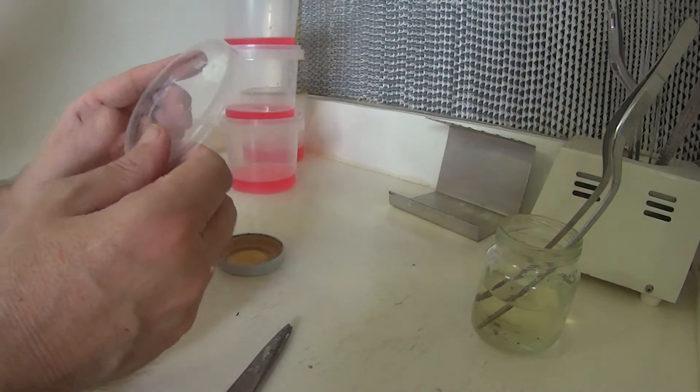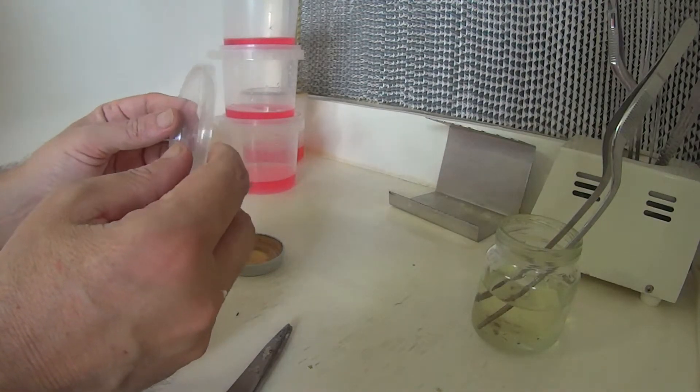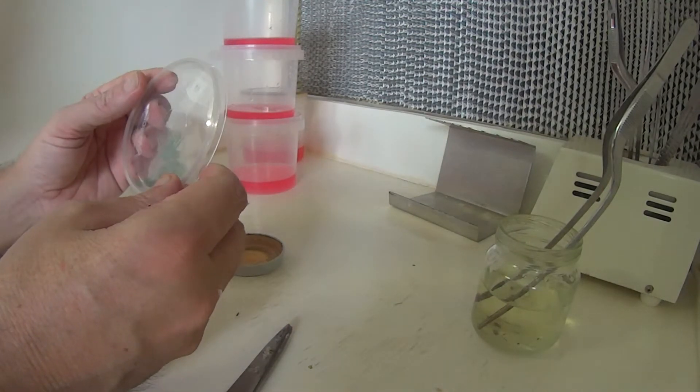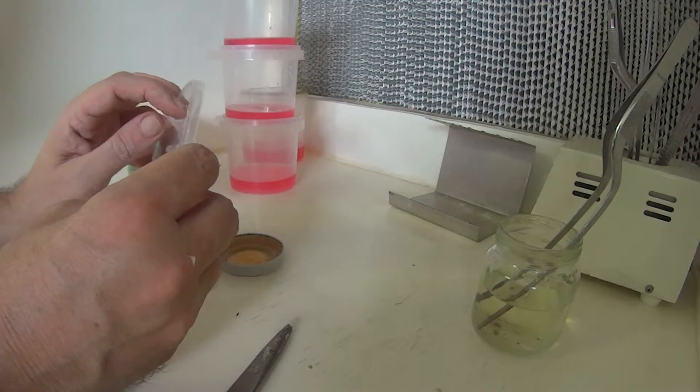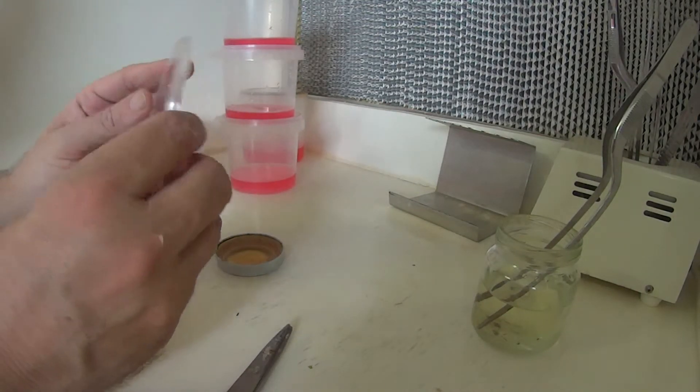And that can be autoclaved or pressure cooked, and it doesn't come off. I don't know how long it lasts for. I've reused lids like this dozens of times, and it doesn't seem to come off. It's a fairly permanent sort of thing.